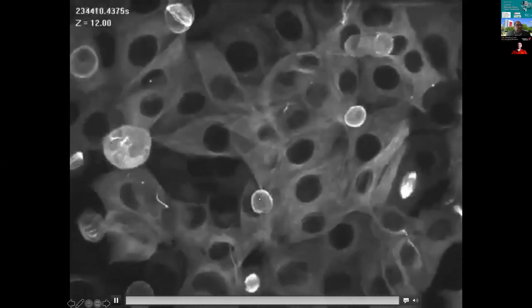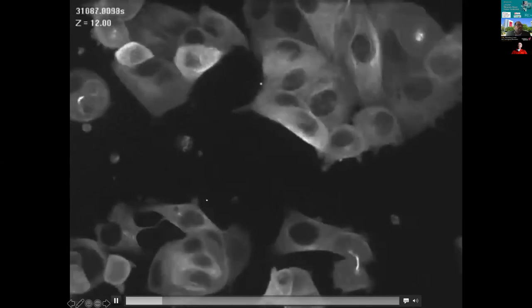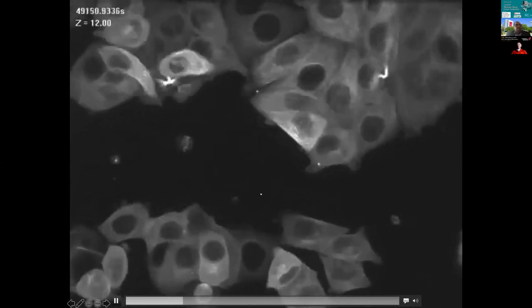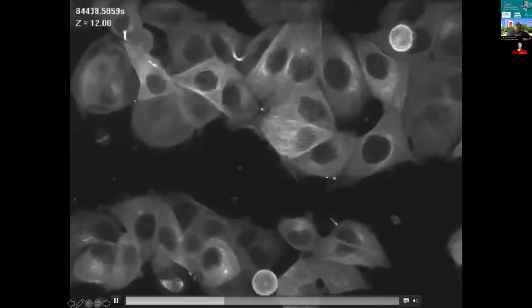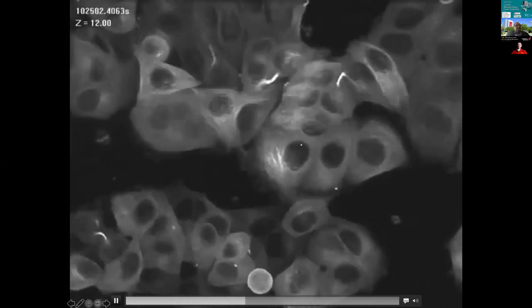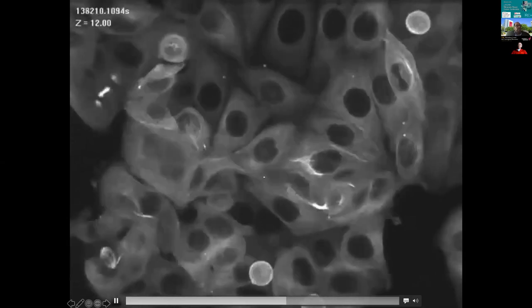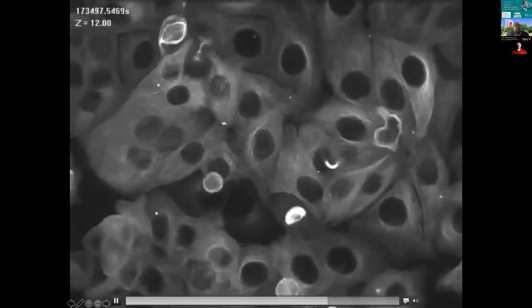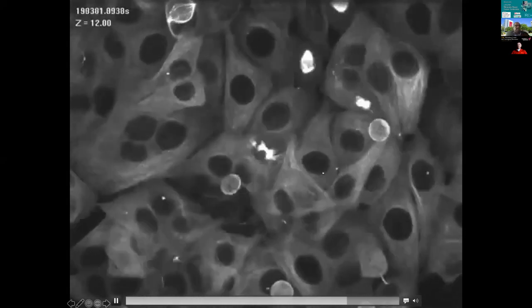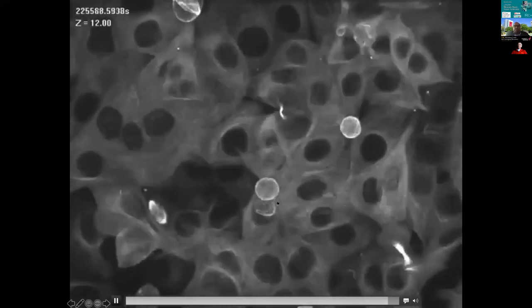So you see this little guy that just came through, and I'll replay the video again. It'll just start floating around. This is, in a very simple way, what metastasis looks like, because these tumor cells are growing very flat and they're holding on to that collagen, for example, that Danny was talking about. And then they'll basically anchor off and they'll start floating around and they'll whiz off. And that's what metastasis is.